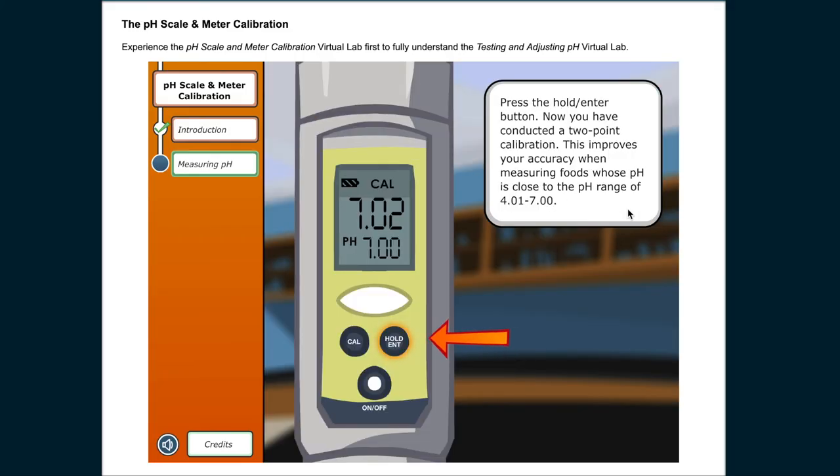Press the hold enter button. Now you have conducted a two-point calibration. This improves your accuracy when measuring food whose pH is close to the pH range of 4.01 to 7.00.